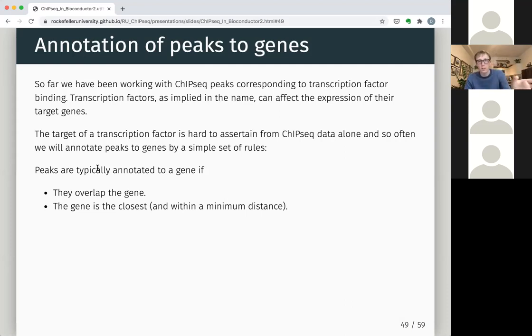You can go to your gene of interest, the one gene that you know and are interested in, and see whether there's a peak there. But obviously the benefit of sequencing experiments and next generation sequencing is being able to assess things at a genome-wide scale. So by annotating all your peaks and doing some of the downstream steps that we'll talk about later on today, you can really start to understand and identify functional impacts of your ChIP that you may not have predicted without looking at the whole genome and looking at genes that you already know might be important in your particular experiment.